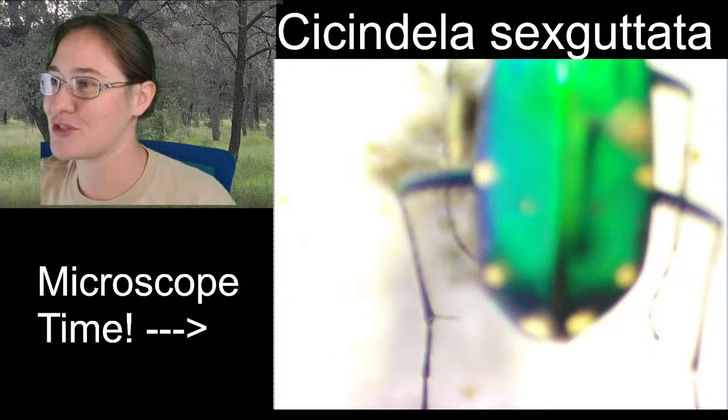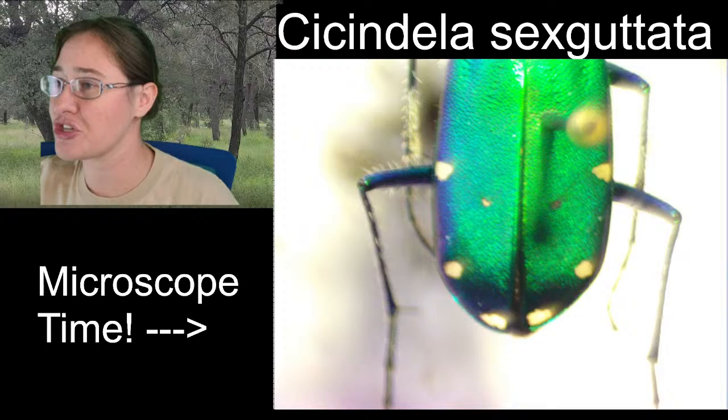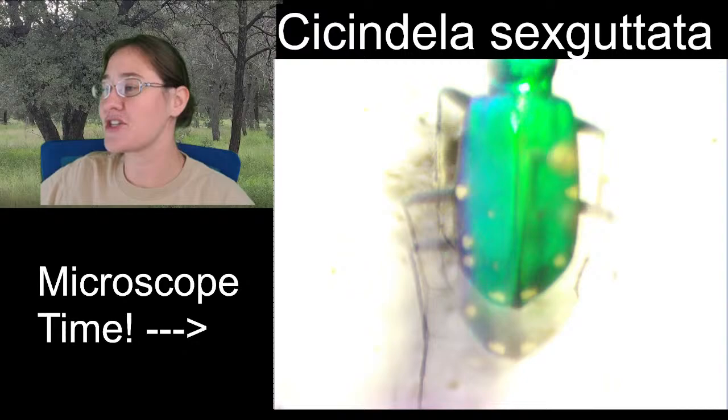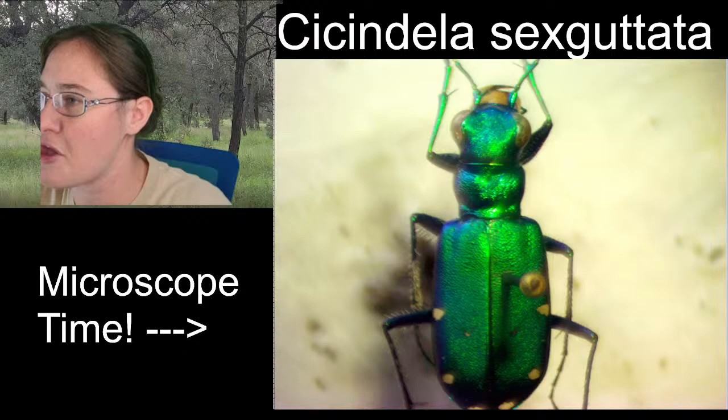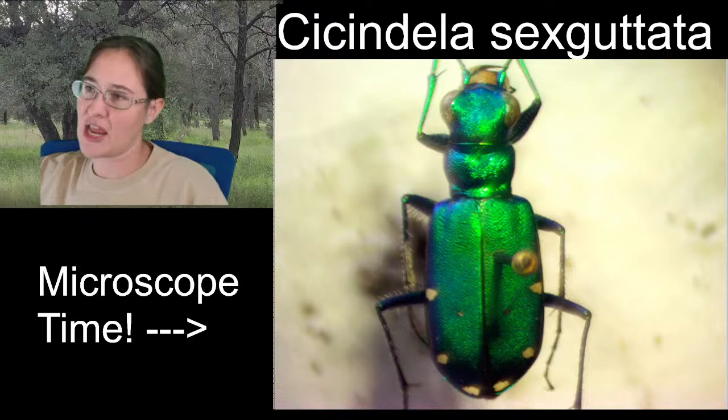So, Susan, I hope I answered your question about the spines on the tarsal segments. I'm actually pretty happy with the time that we spent on my friend the tiger beetle here. I'm going to zoom out our specimen so that you can see the entire guy, get him all focused from the top, just in case you want to get a little bit of the shading with the way the light's hitting or whatever you need.